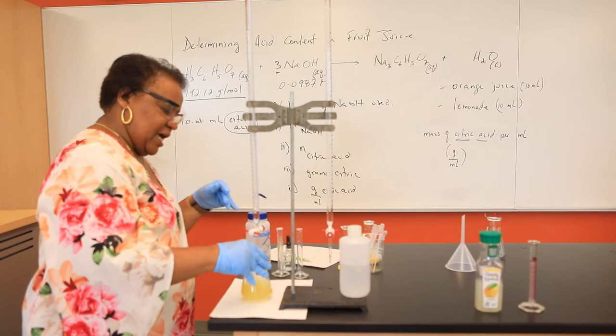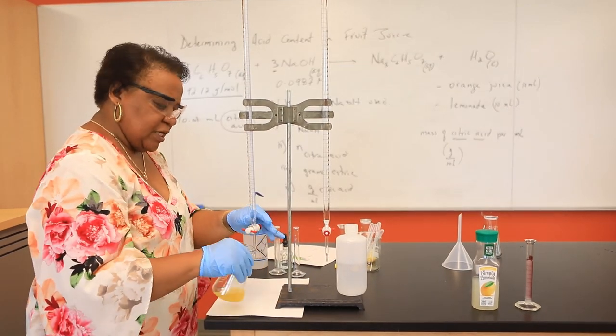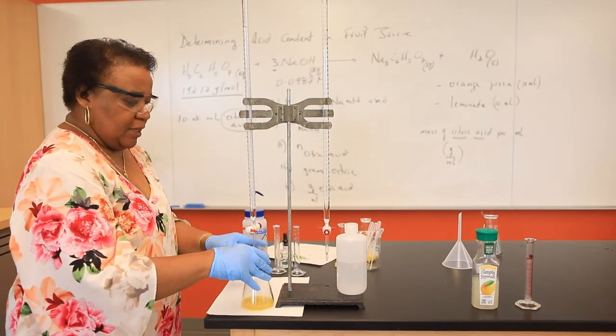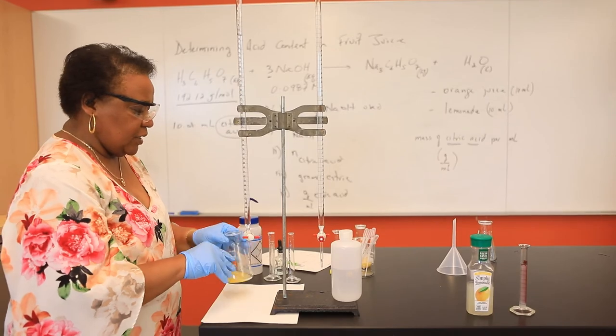So what I did, I kept on adding sodium hydroxide until there was an initial color change. I'm going to be repeating this now with our lemonade.